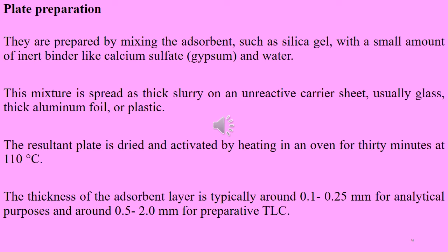Now, how to apply the solution on the TLC plate? It can be done with a microcapillary. For example, in the organic labs, we use 10 microliter microcaps. They are easier to handle than the smaller ones used in other labs. Dip the microcap into the solution and then gently touch it at the marked location on the TLC plate. Don't allow the spot to become too large, otherwise it will cause trouble in the resolution of the spots.